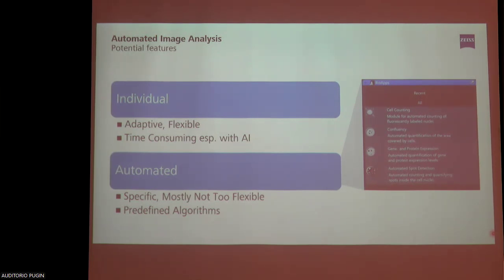Because it is a model that is trained to work on multiple different sample preparations. So it works to a certain degree, which is the case with all microscope-producing companies that offer these single-click solutions. But they work, of course, best if you fulfill a certain workflow. Yeah? If you use specific chemicals, then certain microscope companies, they guarantee you, then our one-click solution will always work.